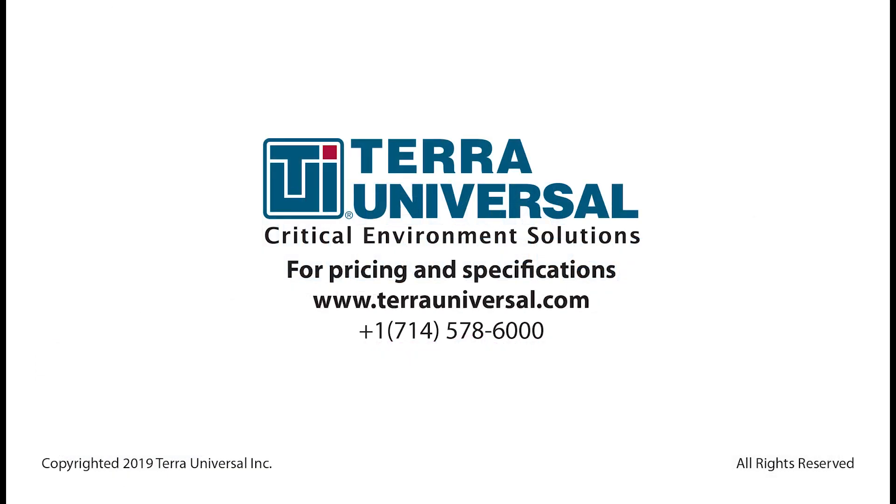Terra also offers competitive pricing, providing great value and high-quality products. Meet your needs with Terra Universal's vacuum chambers and accessories. For more information, please visit www.terrauniversal.com.